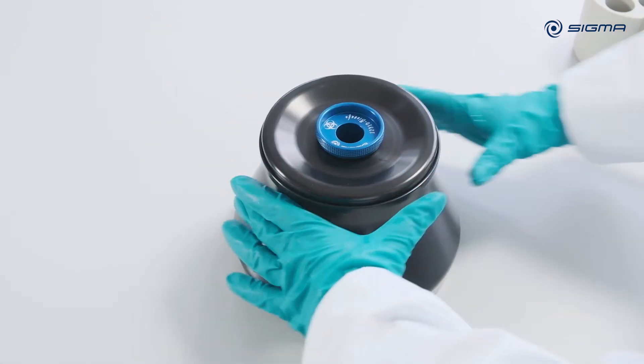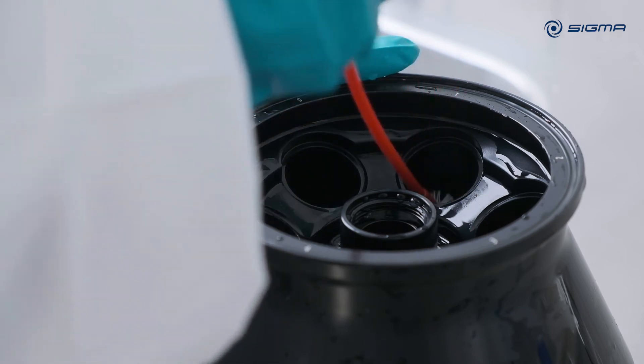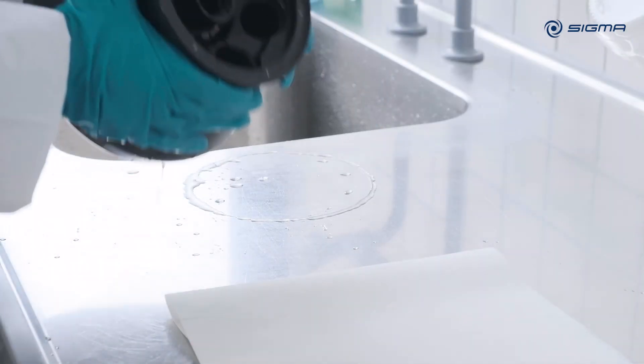If you use a fixed angle rotor, clean the rotor bores with a test tube brush. Then leave the rotor upside down until it is completely dry.